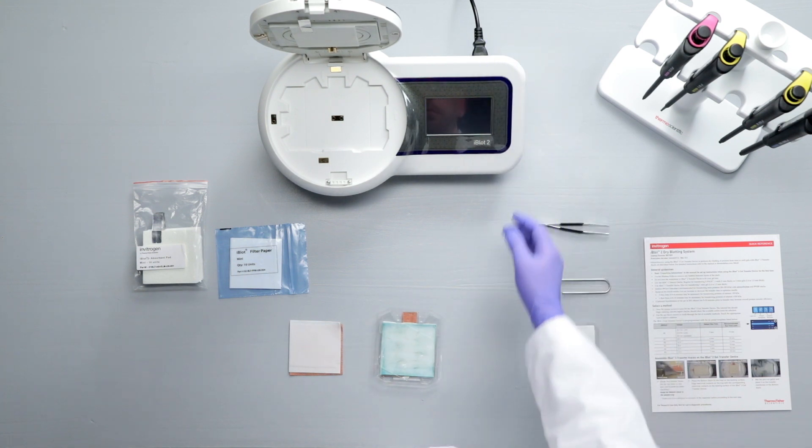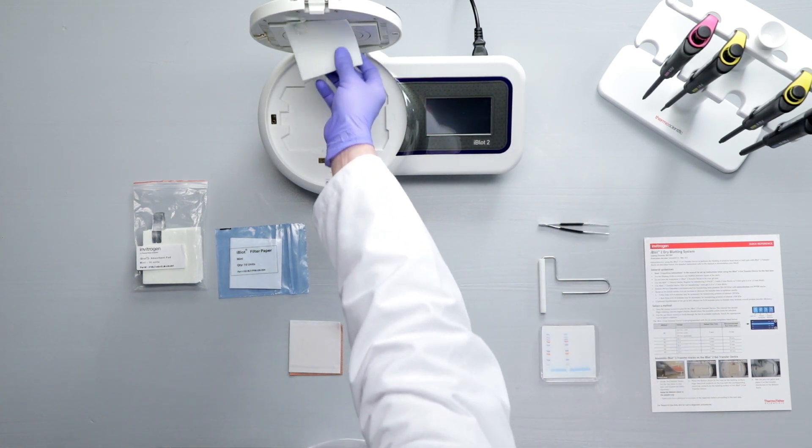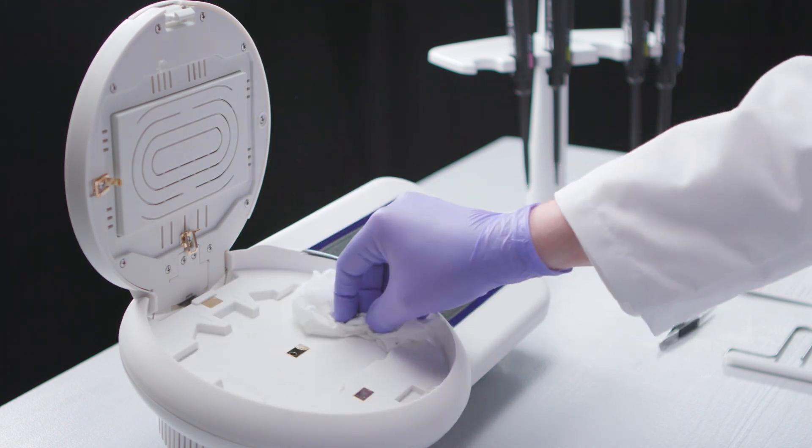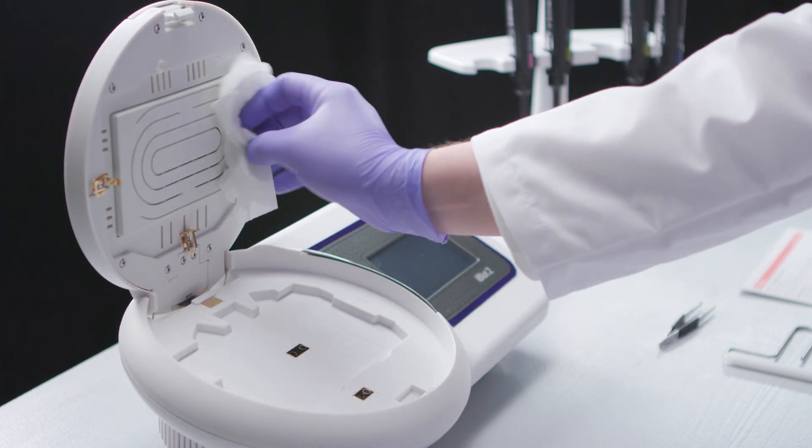To clean the iBlot2 system, make sure the system is turned off. Then, wipe off the blotting surface and electrodes with a damp cloth or tissue paper.